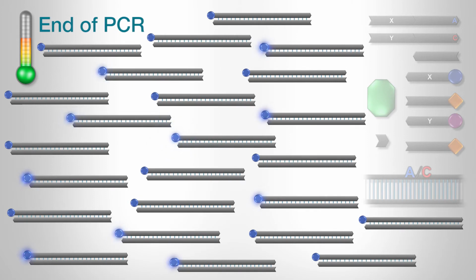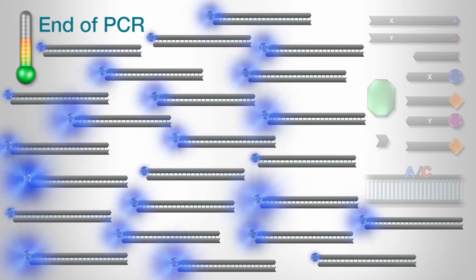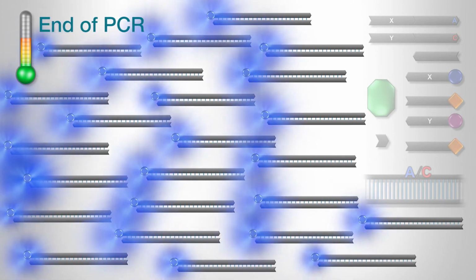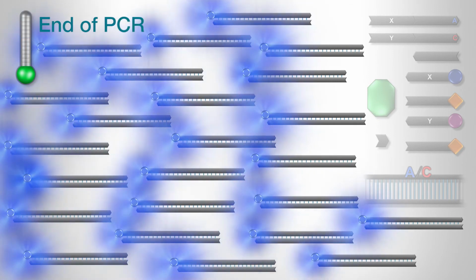Depending on the alleles that are present in the original DNA template, either the FAM-labelled oligo, the HEX-labelled oligo, or both will have been incorporated into the PCR product. In this example, the DNA template was homozygous for the allele A, and therefore only the FAM-labelled oligo has been incorporated. Before reading the fluorescence, completed KASP reactions must be cooled to below 40 degrees Celsius.